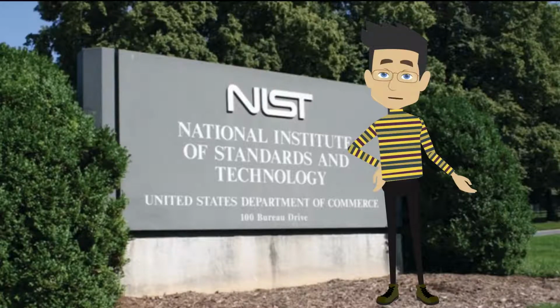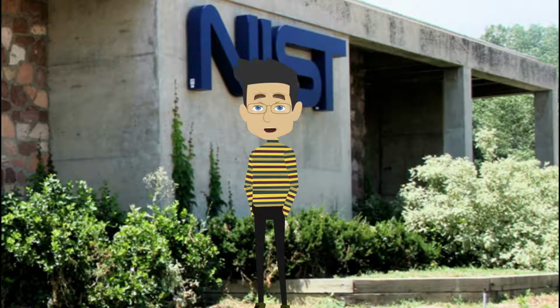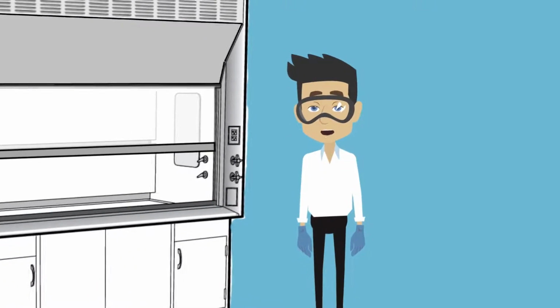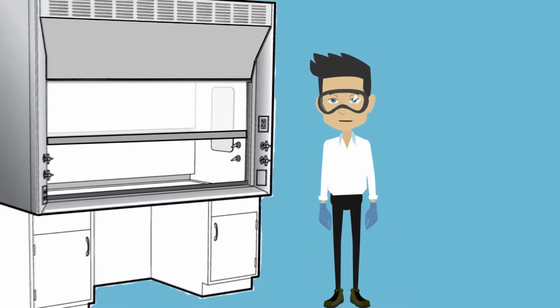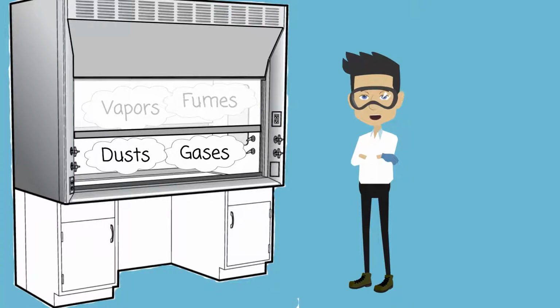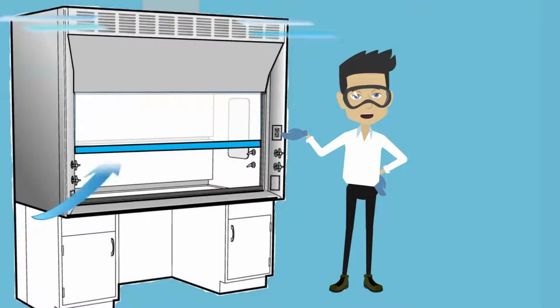Hello there. We've just reviewed conducting a risk assessment and now we're going to cover hazard controls beginning with engineering control measures. In the next part of this training, I'm going to talk about chemical fume hoods. A fume hood, when used properly, is one of the most reliable engineering controls in the laboratory. They protect you by containing vapors, dusts, gases, and fumes generated in the hood, and remove them as air flows into the hood and out the exhaust system.